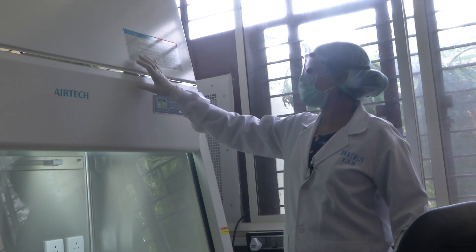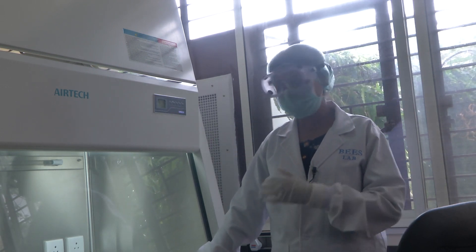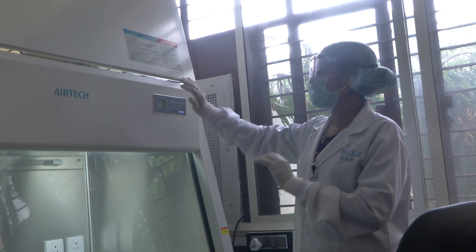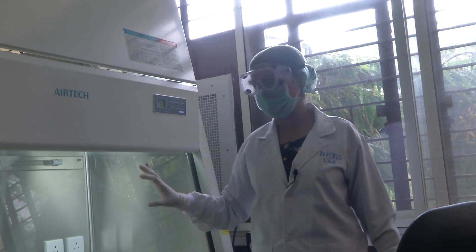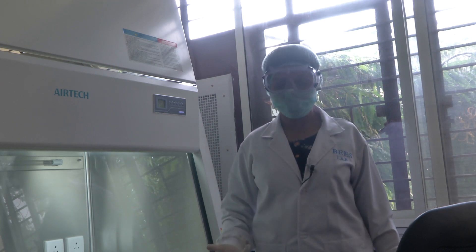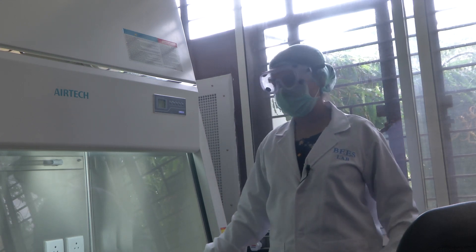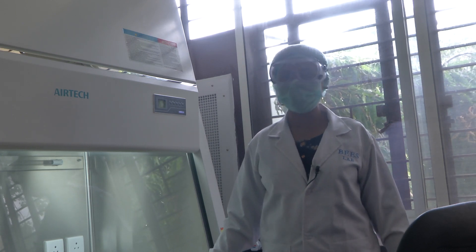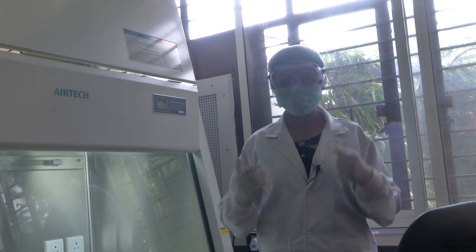The UV light can only be on when the fan is stopped and the sliding sash is closed. As mentioned, UV light is hazardous, so ensure you work accordingly following all the operation guidelines. This was a brief introduction about how a biosafety cabinet can be used when working with pathogens that could be a potential hazard to the personnel or the environment in the laboratory. Let us see in future modules what other devices can be used and integrated and how they can be used to solve our purpose in the lab. Thank you.